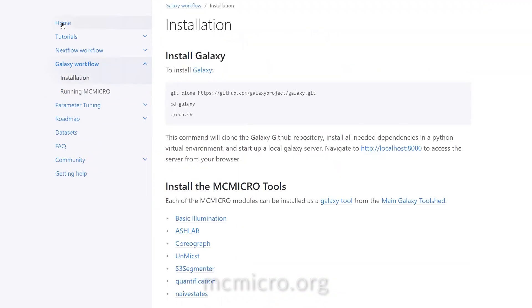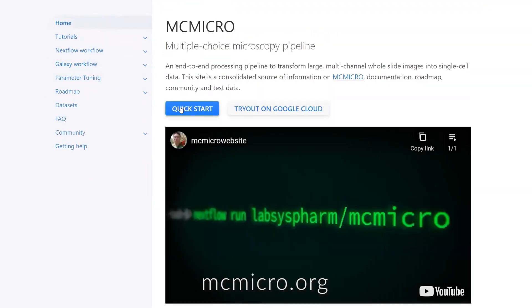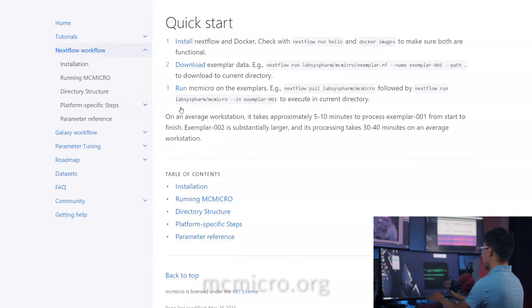To get started, head on over to mcmicro.org and click the quick start button to install and run a test example.